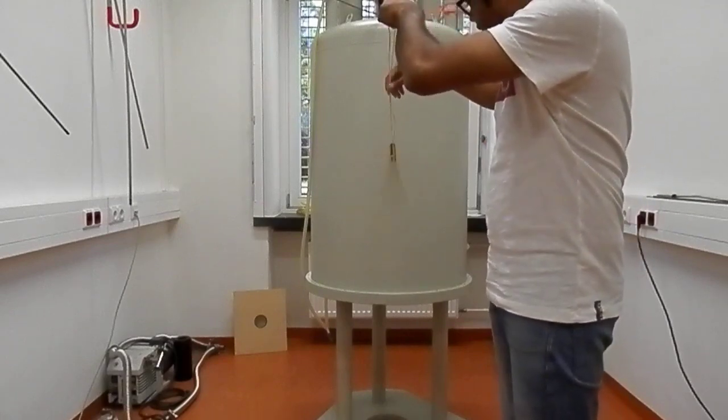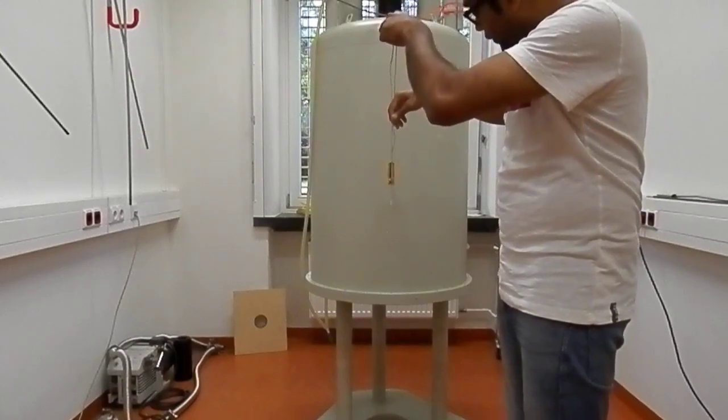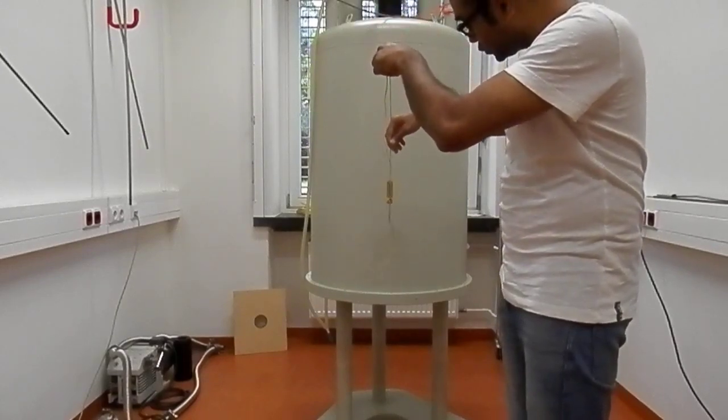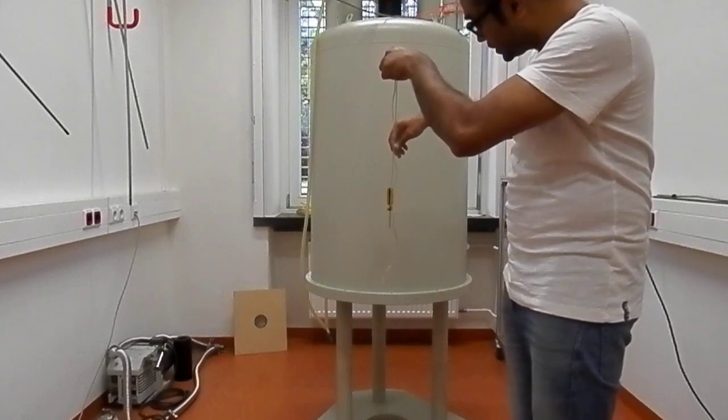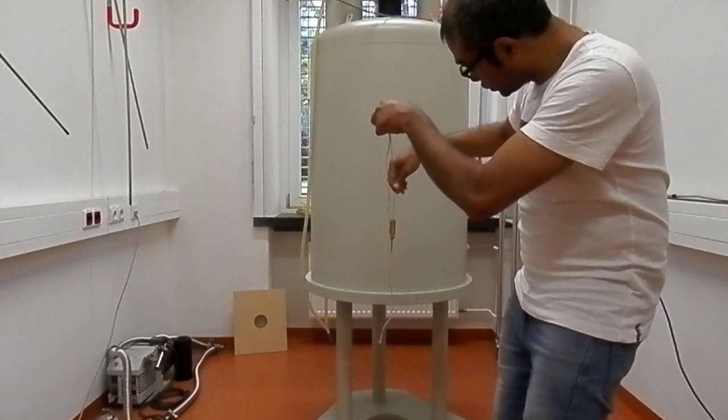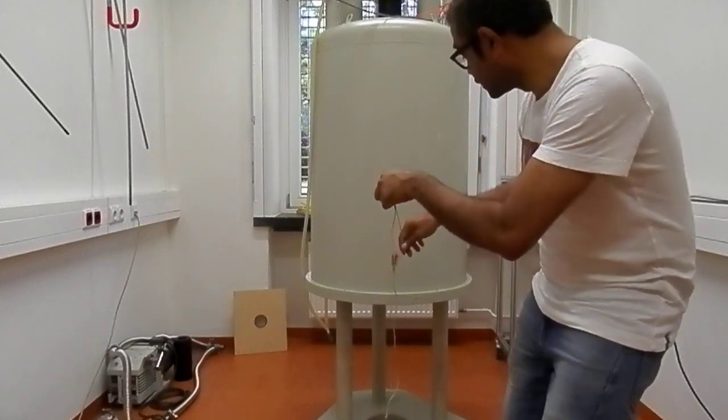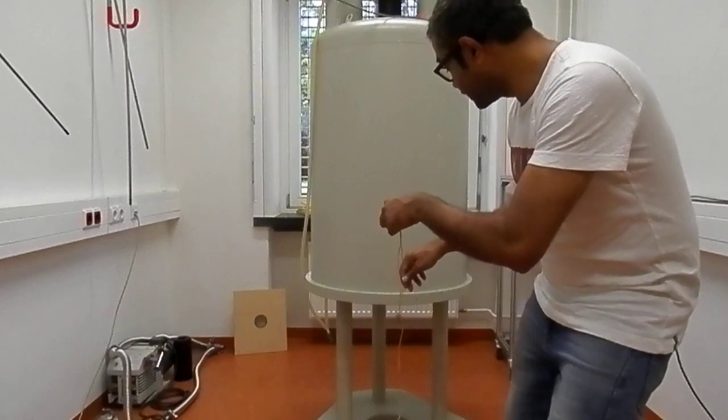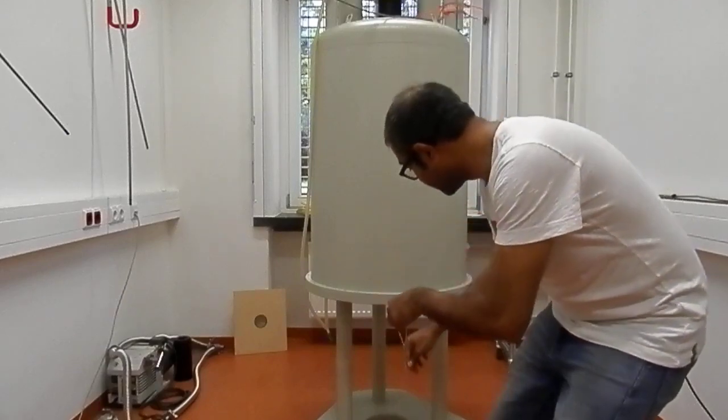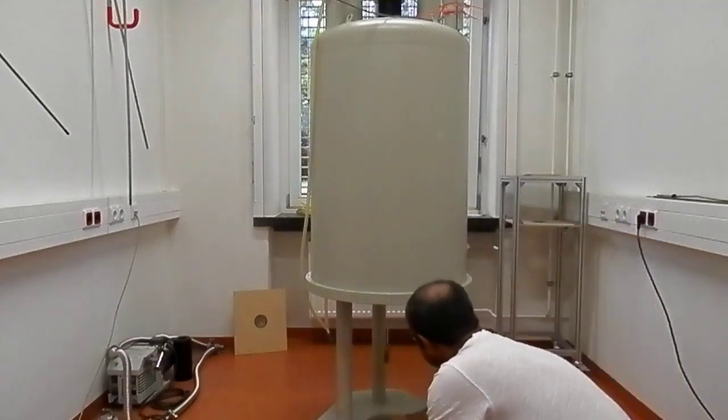You can also hear the sound because it is hitting. Now as we are putting this magnetic material slowly down, you see it started to change the orientation of this screwdriver. By this way, you can go completely to the bottom of the magnet.